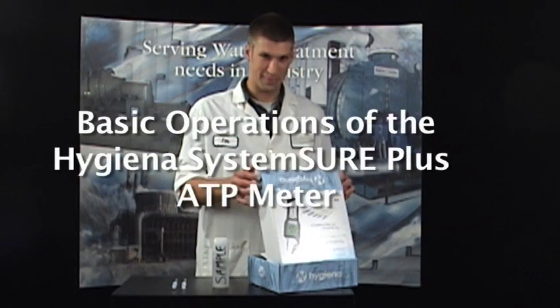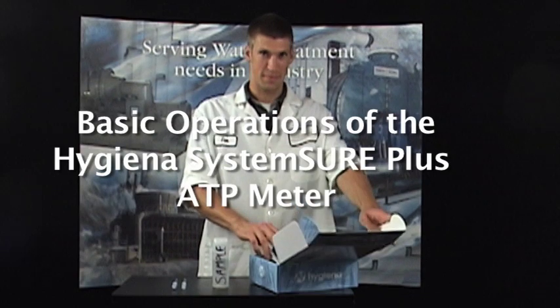Today we will show you basic operations of the Hygiena SystemSure Plus ATP meter.